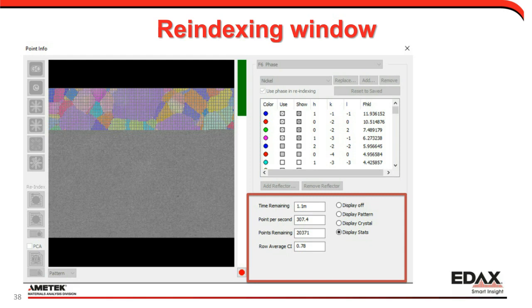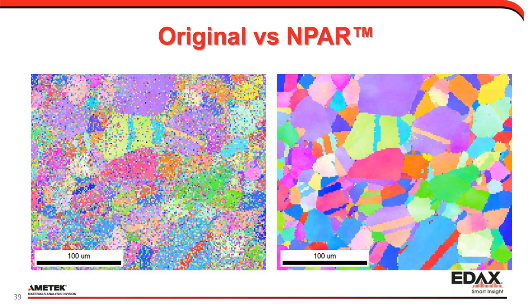Now, with that, after this reindexing, the next real question is, what kind of effects does this have on my data? That's something we cover a lot in our M&M talks this year. After those are given out, we'll probably have copies that we can share with you guys. The big thing with redoing this data is that in the end, it doesn't really have that big of an effect on the things that you think it would.